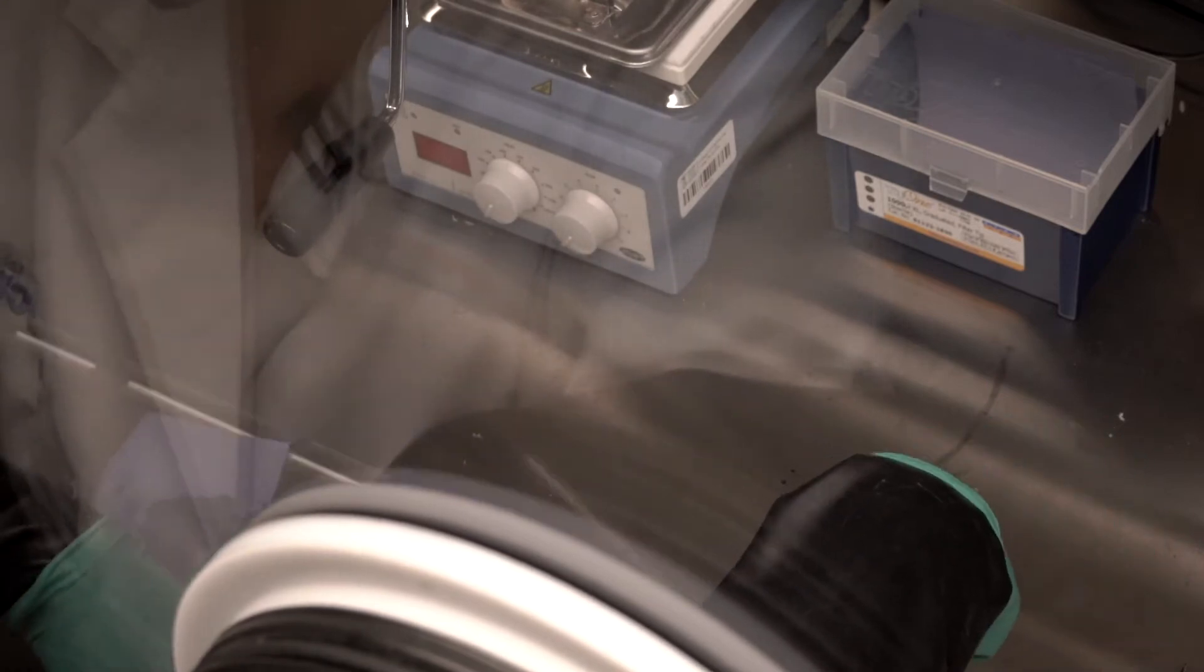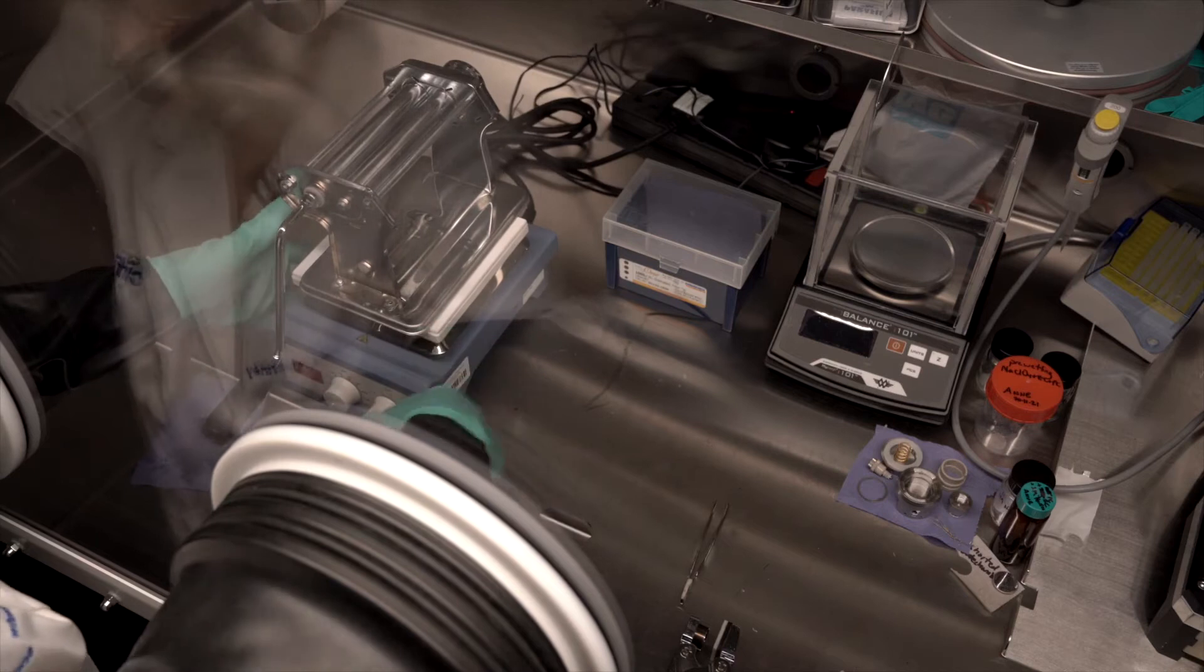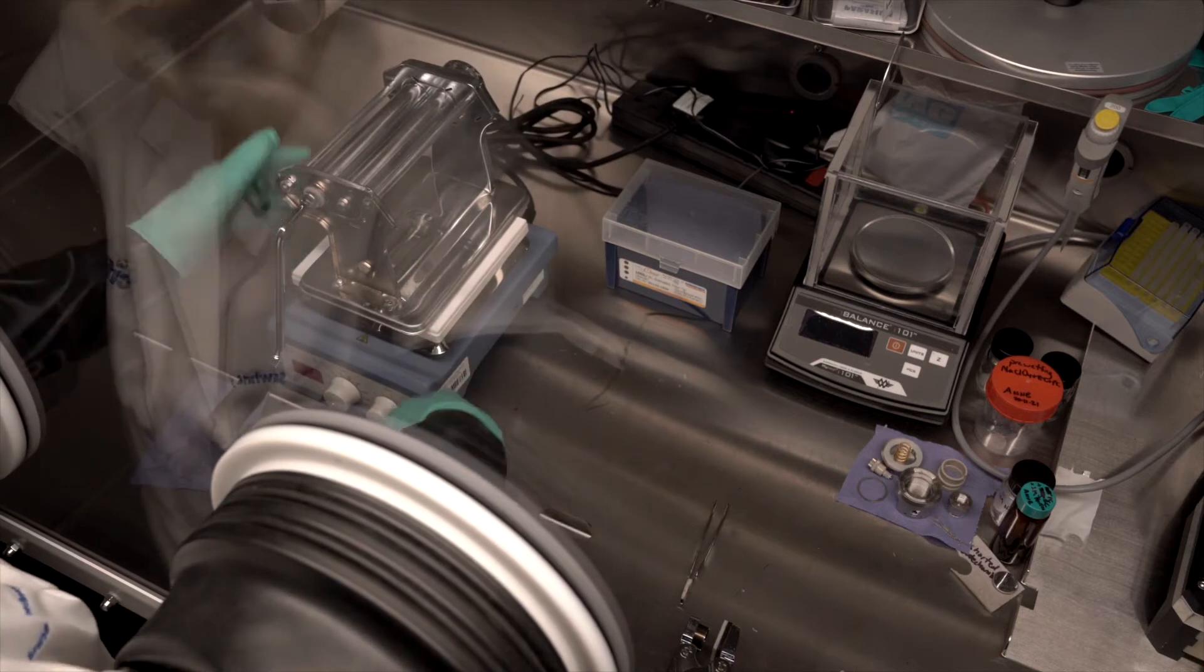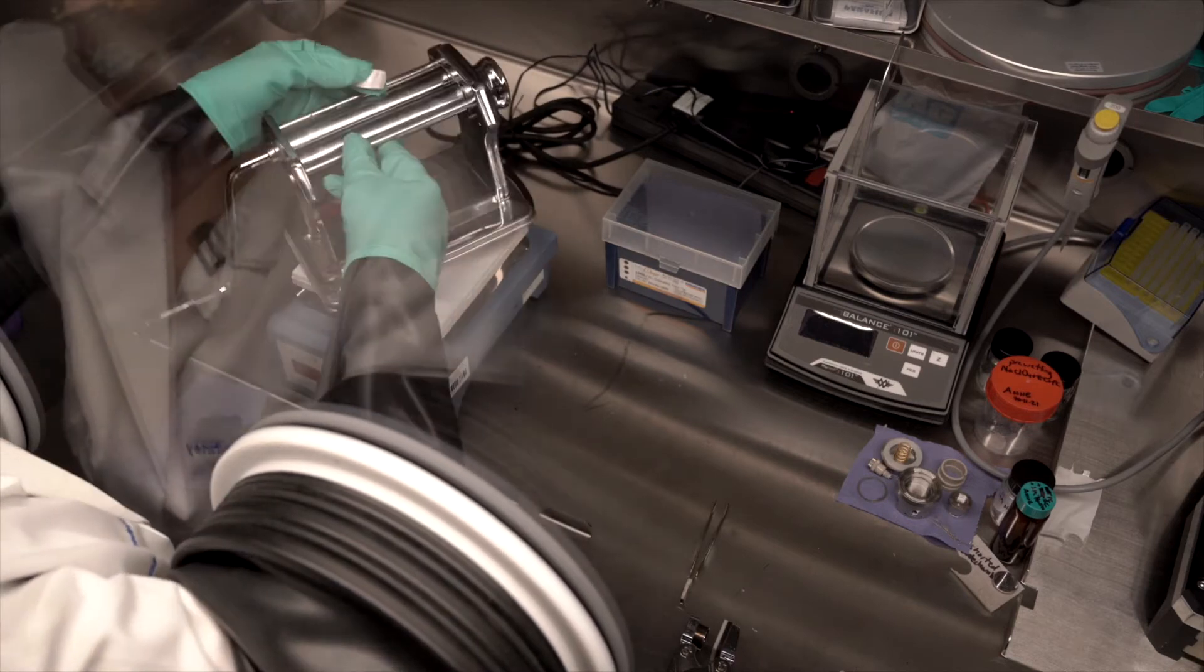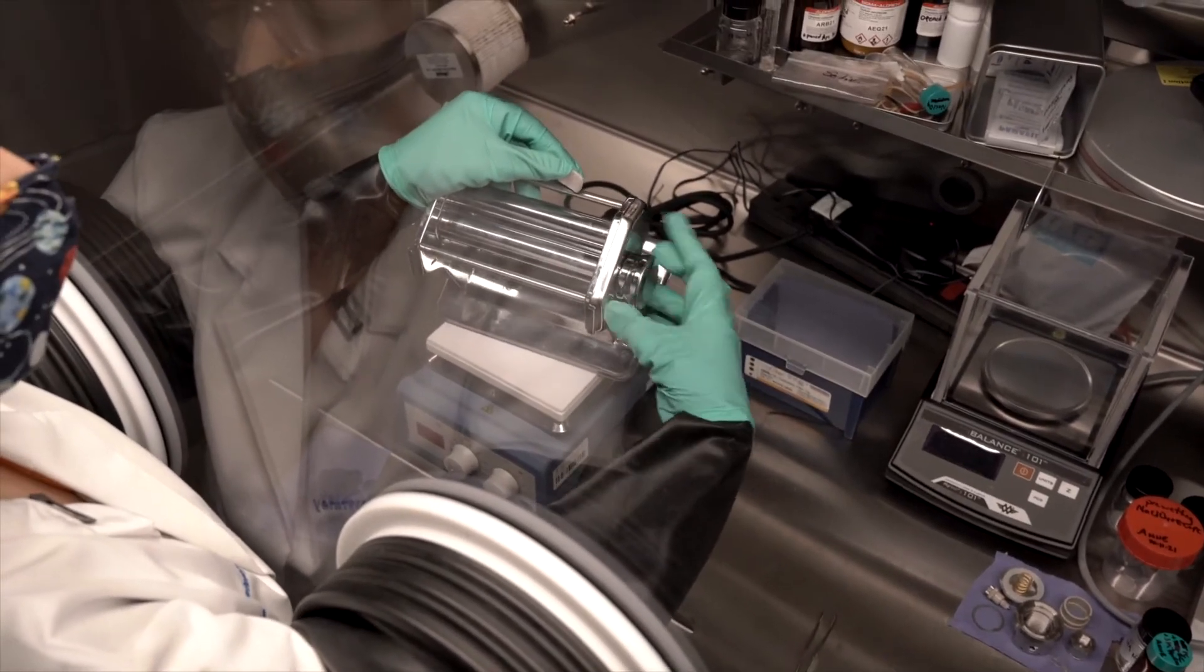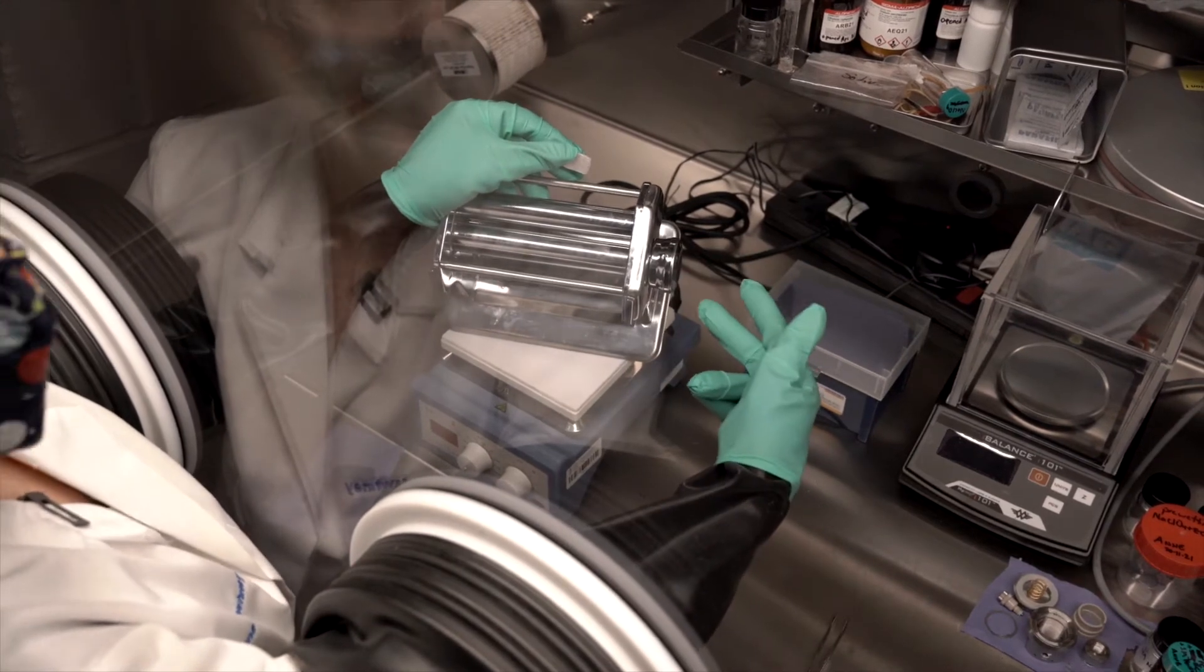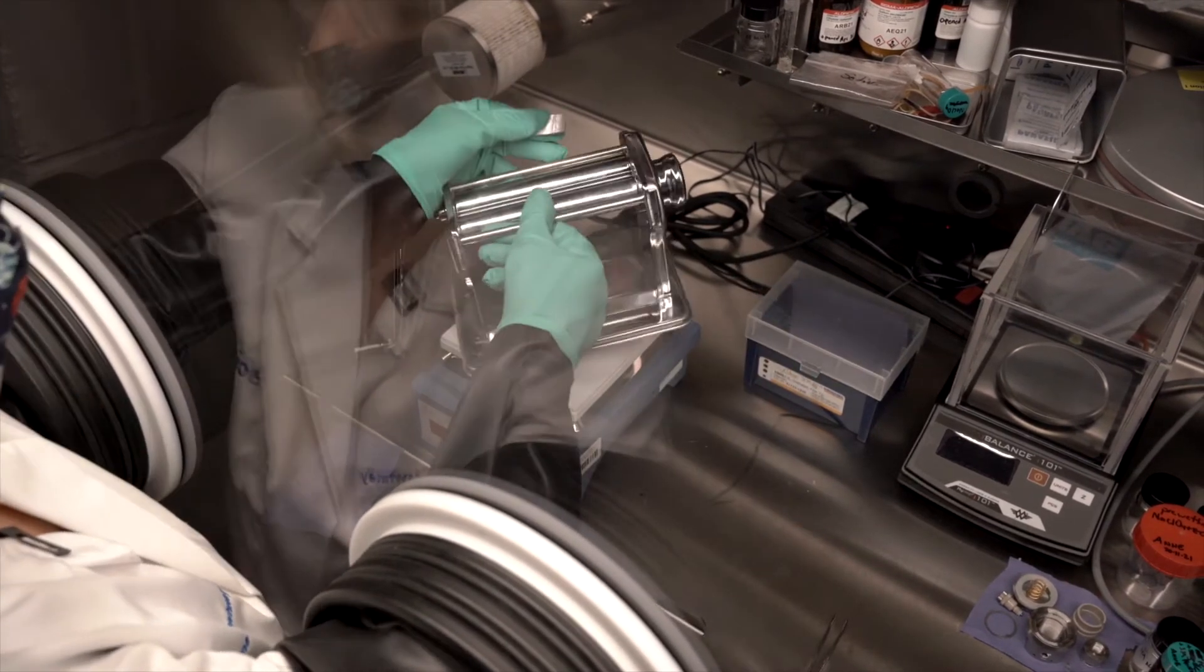So, now I'll move over to my pasta press. If you've used one of these to make pasta before, the principle is exactly the same. You want to start with your biggest gap size. And then progressively with each roll, go to a narrower gap size.